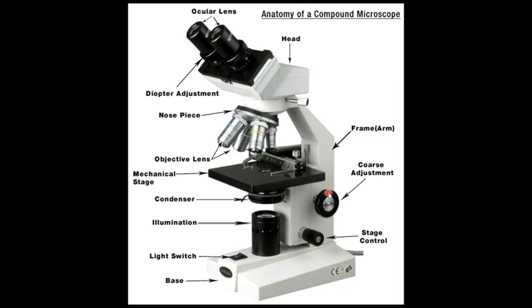So you take your slide, and you put it in the slide holder here. I call it the little clippy thing. There's a little knob. You can see it kind of back here that you pull, that little lever. This thing swings out. You put your slide up here into this corner, and then you just let go of it. And this little lever comes in and will hold the slide in place.